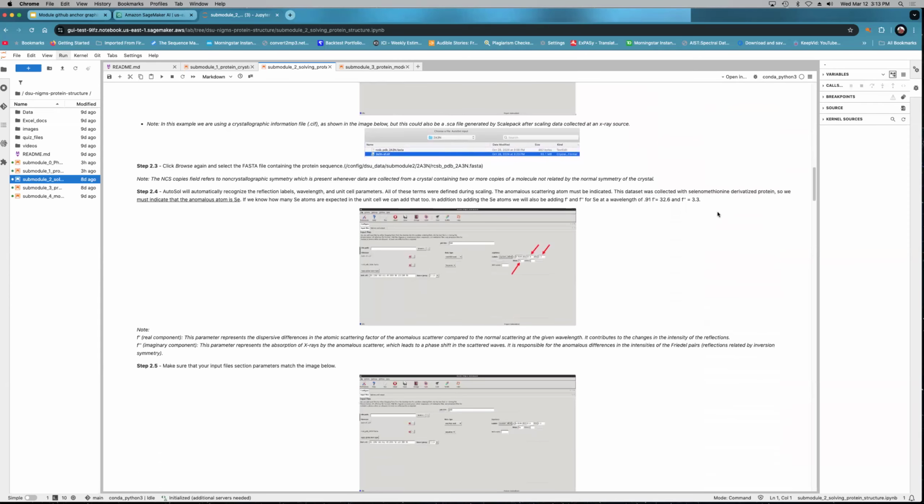You will need to add a few more pieces of information, like what is the anomalous scatterer, which when dealing with SAD phasing is often selenium. So selenium is a heavy metal, or heavy atom anyway, that's put into these proteins often through growing the protein as a selenomethionine derivatized protein. We use methionine auxotrophic organisms to do it, for example E. coli.